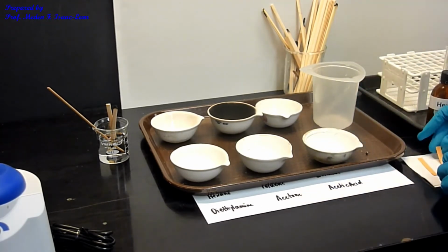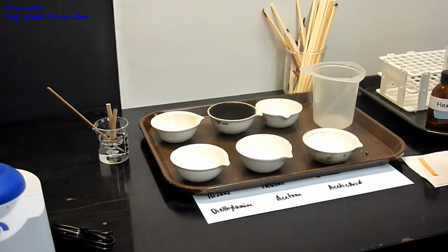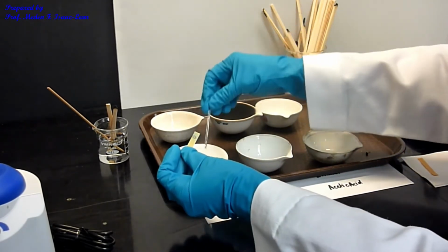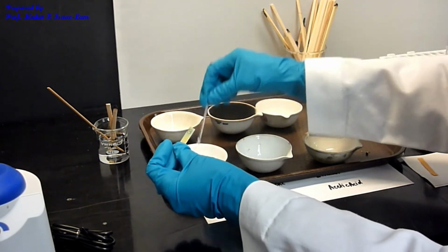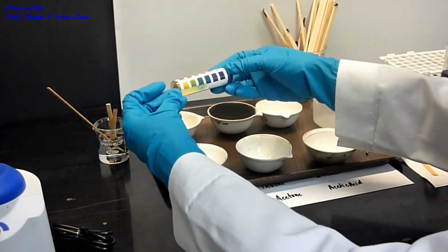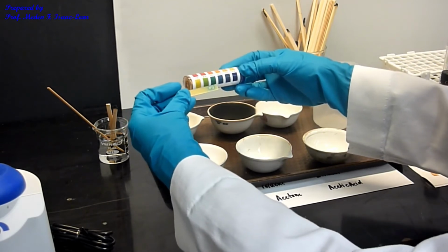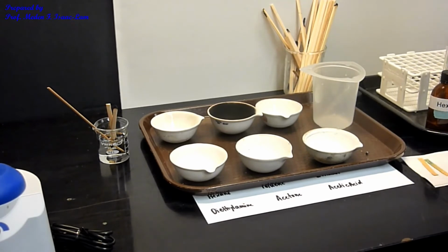I'm gonna use this other end of this paper, and dip the stir stick. Oh, okay, so now this one changed color. Okay, so this one now is about, I would say 9. Okay, so 9 is the color, pH 9. All right, so that one was the diethylamine.